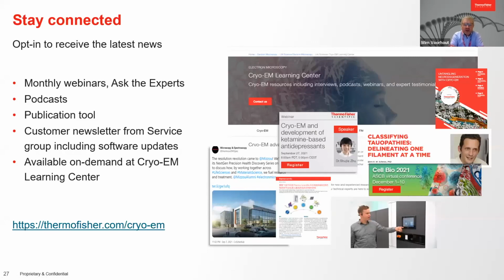So that's what I wanted to share with you in the field of cryotomography, what is happening, especially on the sample preparation side, because the sample is critical. You need a perfect sample to get to these high resolution results. If your sample is not good, you can have the best microscope in the world. You'll never get to a good reconstruction and to a good structure of the molecules of interest.